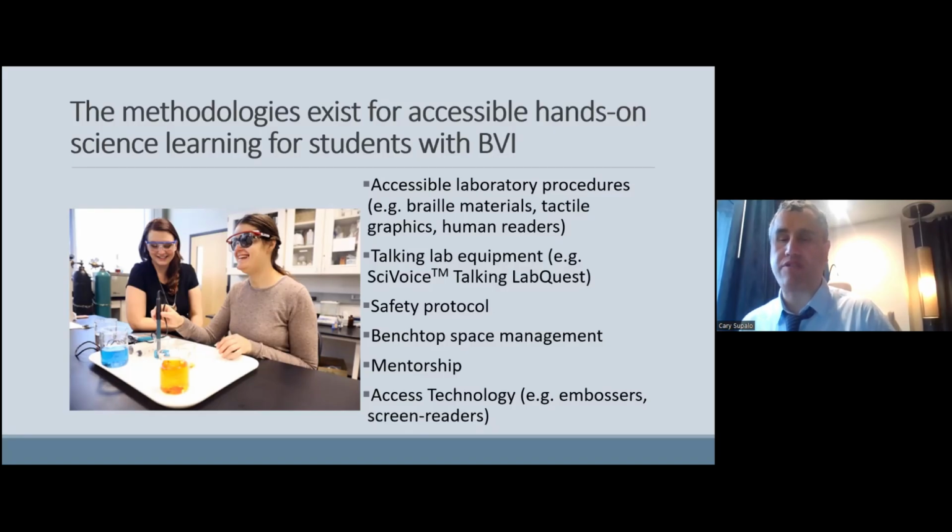And then, of course, I mentioned benchtop management, knowing where you put objects in your laboratory workspace. We recommend that you use a cafeteria-style serving tray to serve as a tactile indicator on the benchtop to where spillable and breakable items might be placed. And if a blind student is working with a laboratory team, then they can agree on some basic conventions of putting anything that's spillable on the tray to serve as a tactile indicator. And we also found that putting extra beakers to support graduated cylinders so they're less toppleable is also a valuable technique.